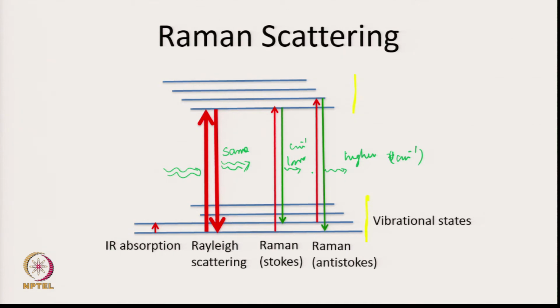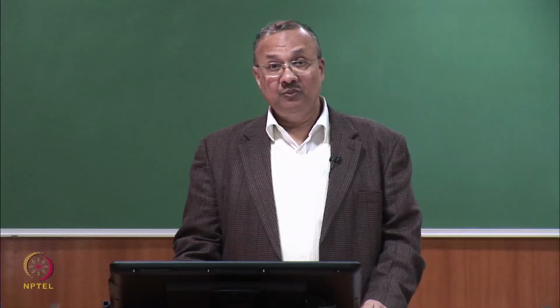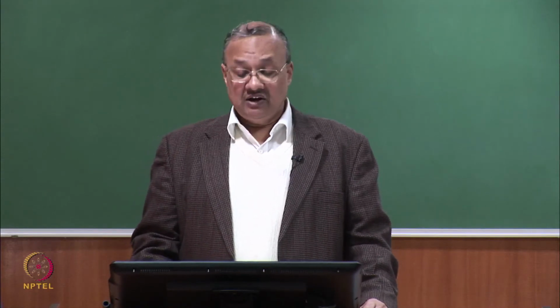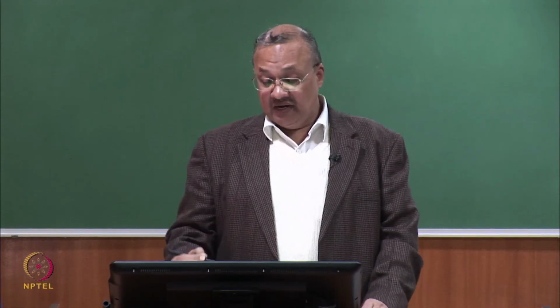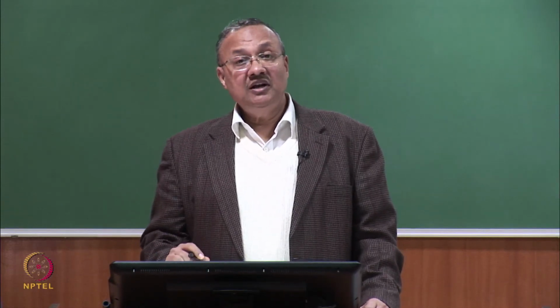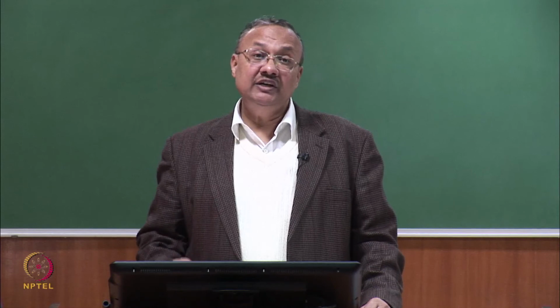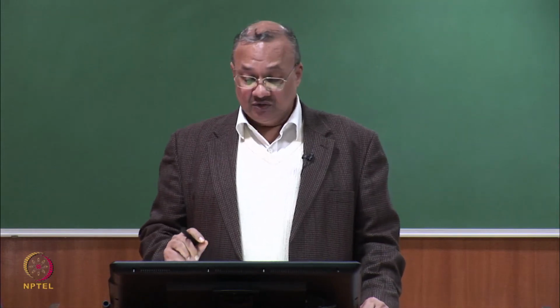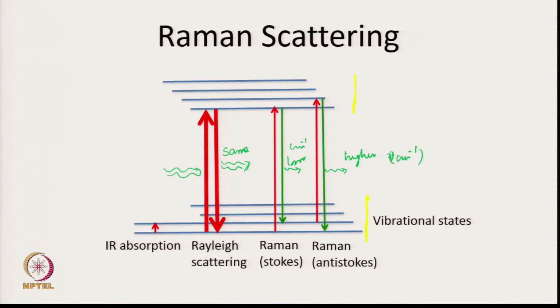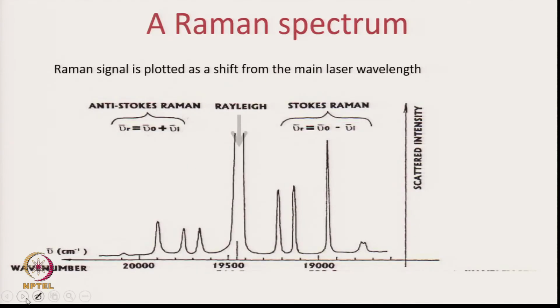So, it does not matter what light we put in a Raman spectroscopy, what matters is how much it got shifted, and as you can see from the diagram again, that gets shifted by one vibration level. One vibration level means it can actually detect that bond vibration. So, this is what we are looking at. Let us come to the next slide and look at the spectra.